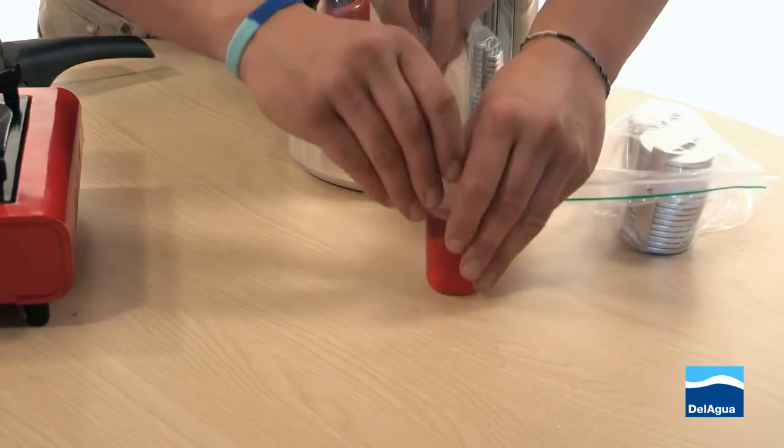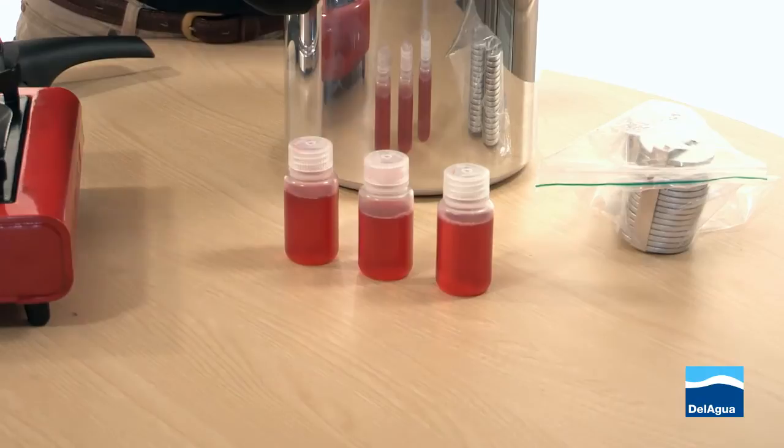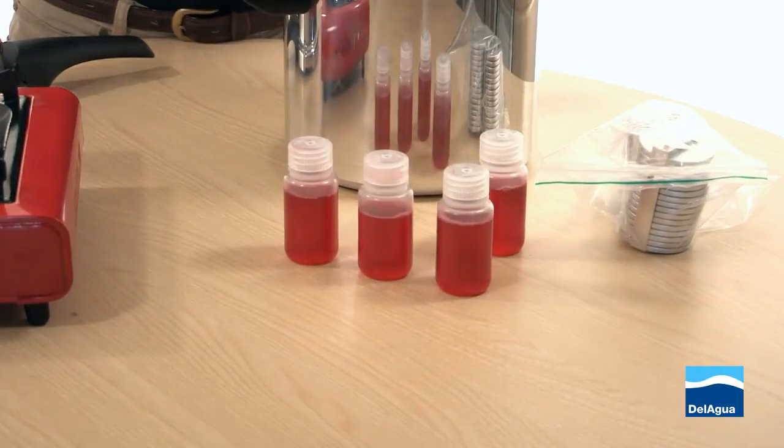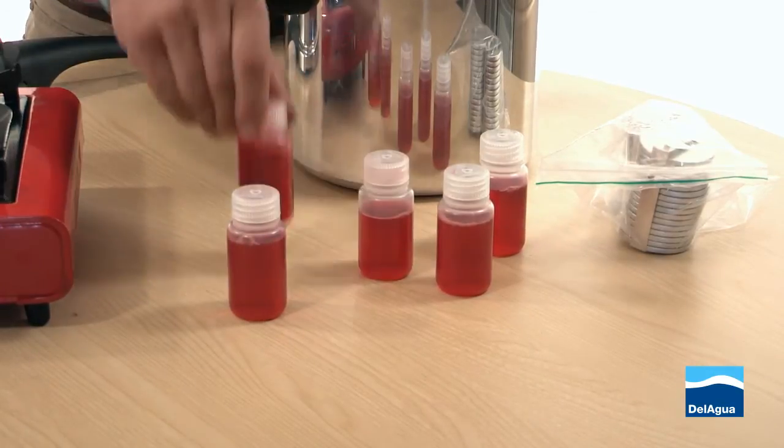Allow your sterilized media to cool completely down before you then subsequently tighten the lids and place them into the fridge or a suitable cold storage container.